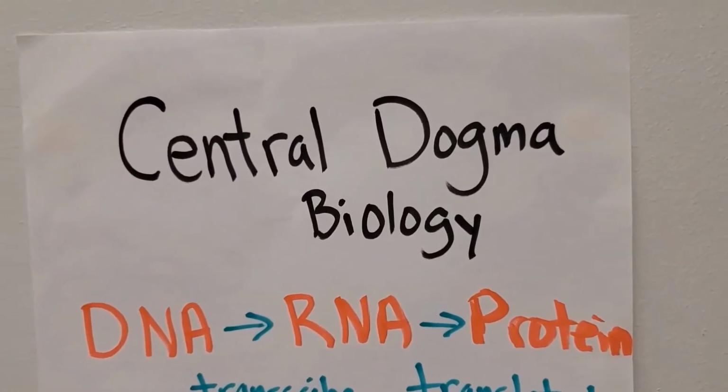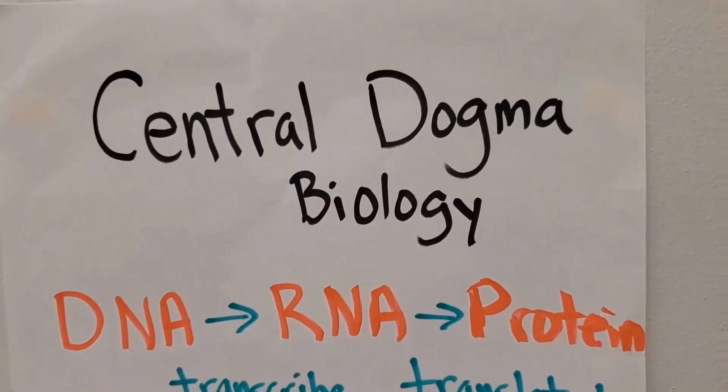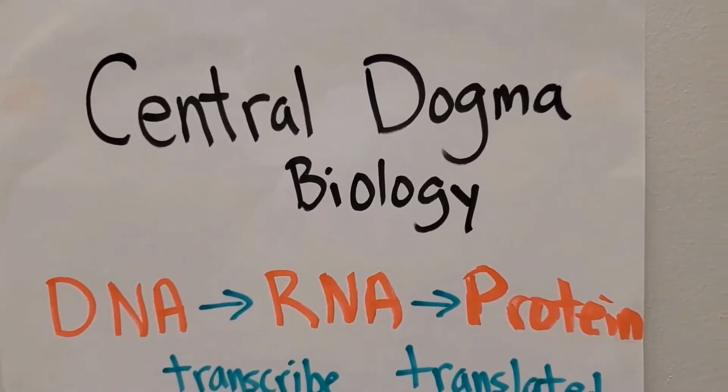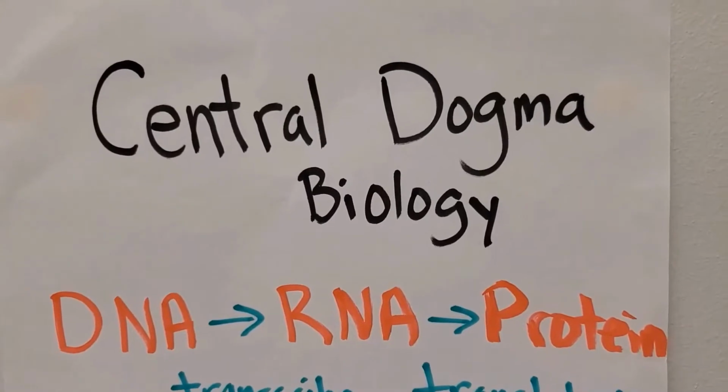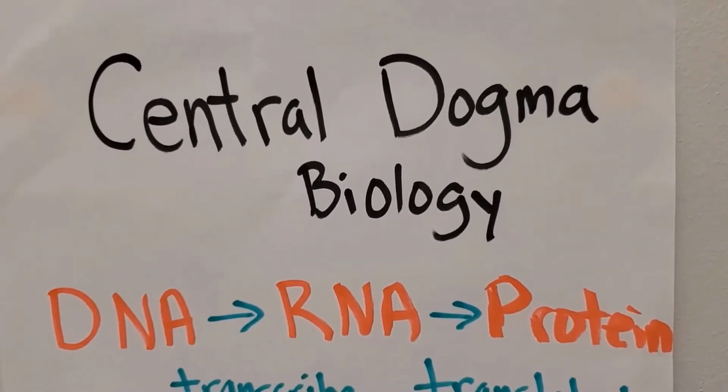Before showing you how I perform my cDNA synthesis, I like to start by briefly going over the biology of it and how that applies to the technique in the lab.